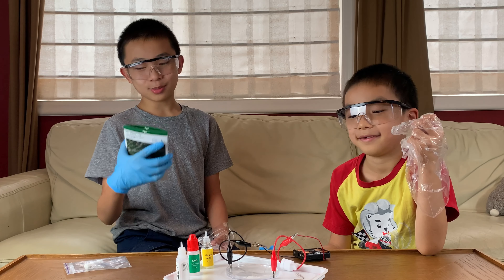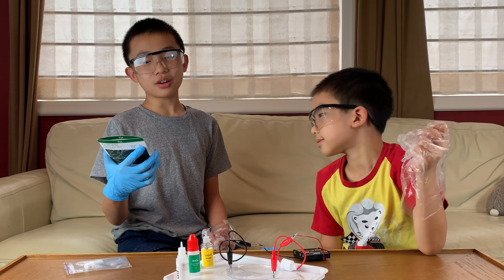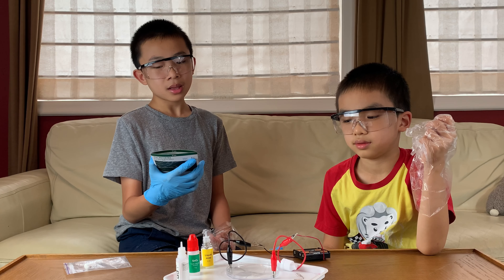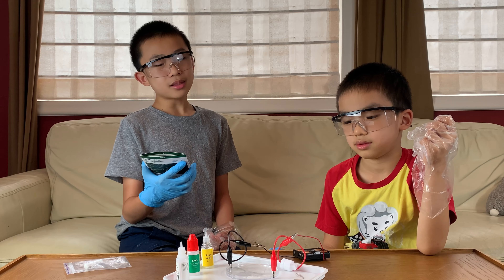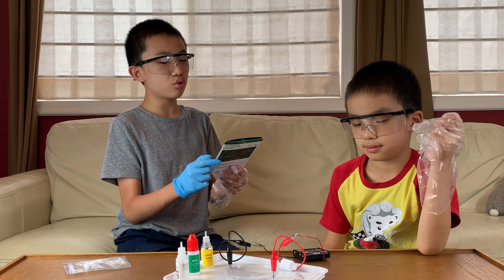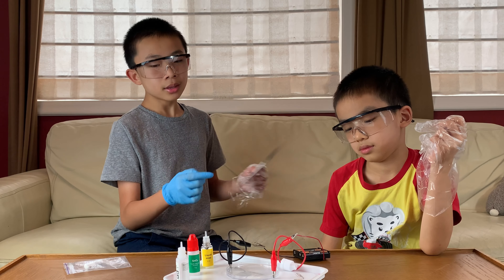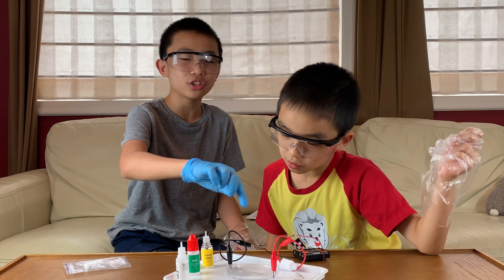This is the science behind the experiment: batteries are basically electron pumps — they suck electrons in with their plus and pump them out with their minus. When such a pump is connected to a solution via electric wires, a variety of chemical reactions can take place. By the minus (black), some particles will capture the electrons pouring out. By the plus (red), some particles will give their electrons away.